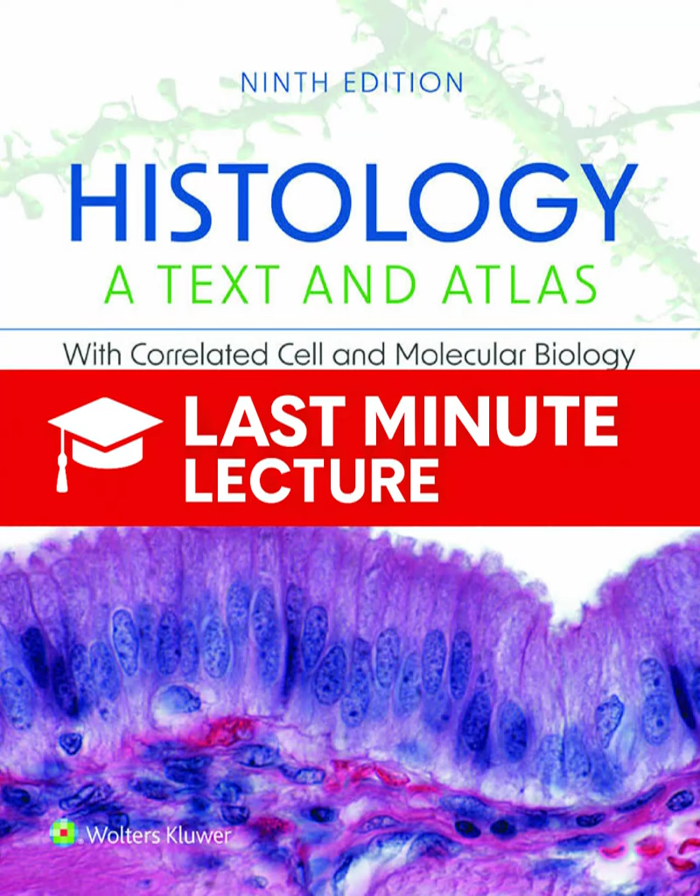So why does closing that condenser aperture a bit actually enhance the contrast? It has to do with the light paths. Closing the aperture brings the intensity relationship between the light that's diffracted by the specimen and the non-diffracted background light closer to a 1-to-1 ratio. It allows for optimal interference, which is what maximizes the visible contrast in the final image.